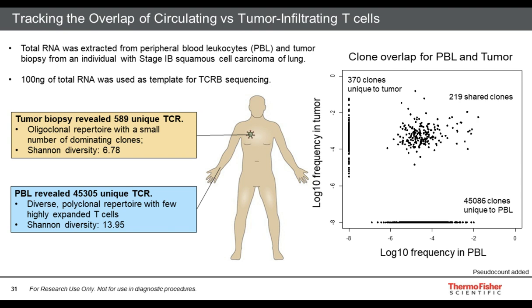So moving on to that first study, the question of interest that we were looking at was whether we can identify immune cell co-infiltrates that influence T-cell function in the tumor. Just before diving into the data, I'd like to first review the concepts of evenness and repressive and permissive tumor microenvironments. Evenness is a metric of the repertoire that we often use.